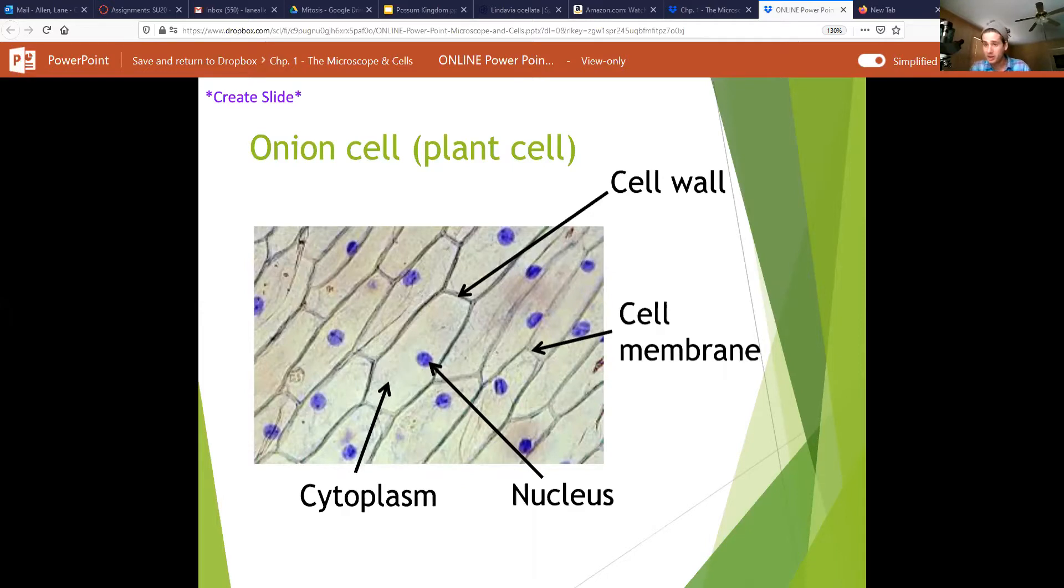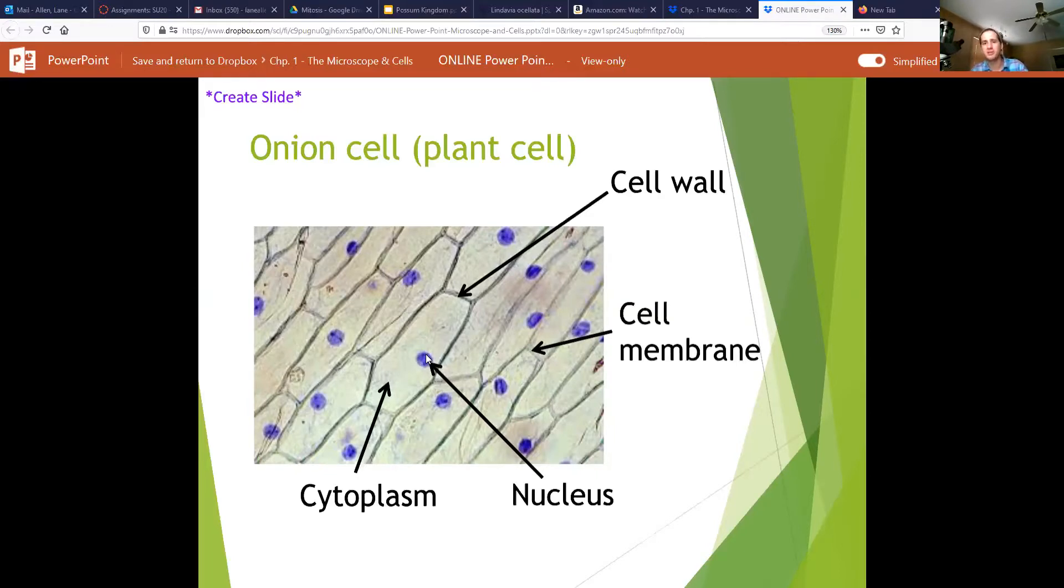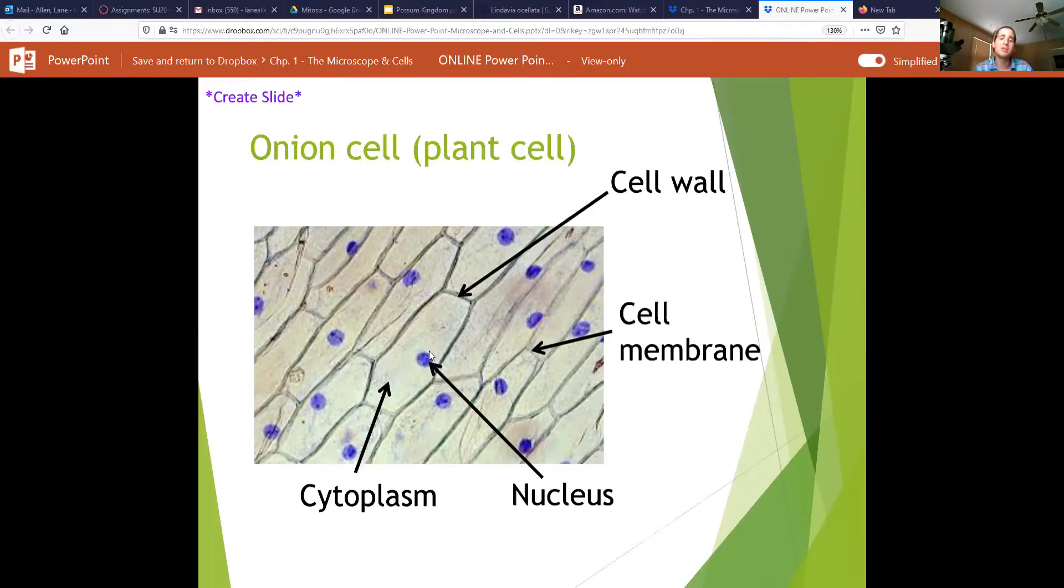There should be a large, single large round structure on the inside of the cell. It'll be the only internal structure visible on these onion cells, and that is going to be the nucleus.